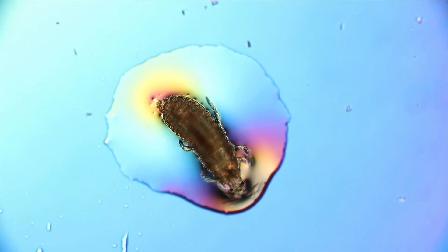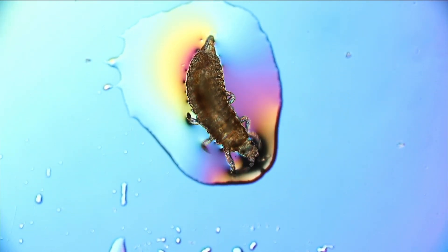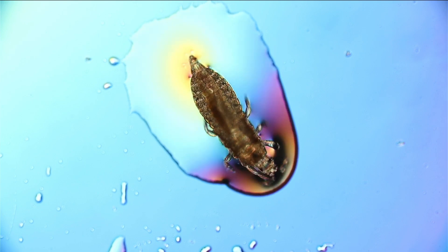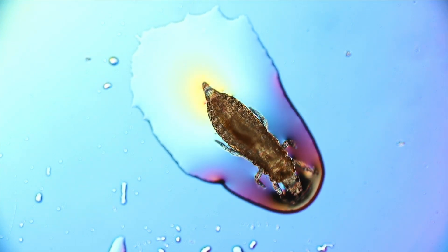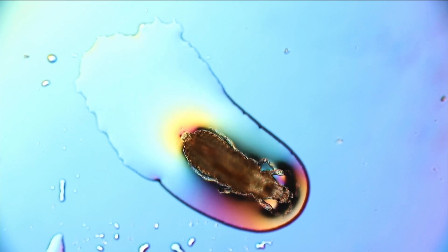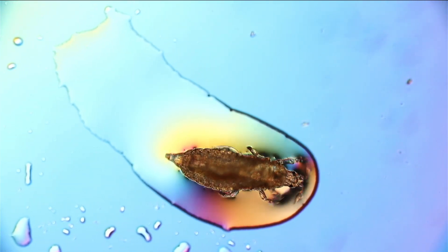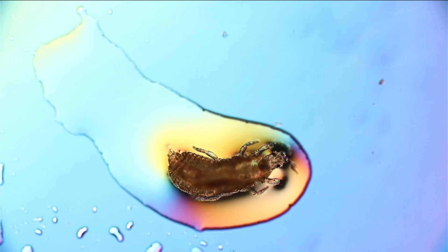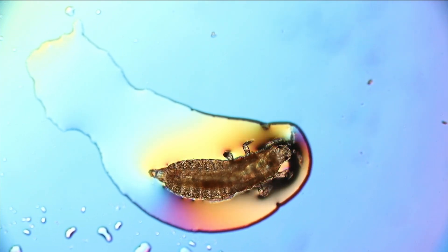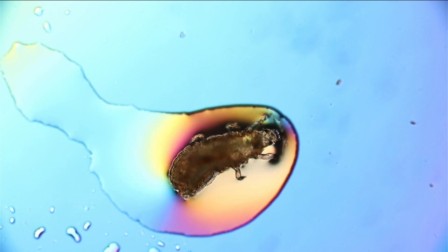I decided to pick it up and transfer it onto a microscope slide to have a closer look. I used a little bit of cooking oil — vegetable oil — because water would have too high a surface tension and I had real problems picking it up with water. So I tried it with oil, much more successful. And here you can see this little larva dragging along a little oil droplet as well.